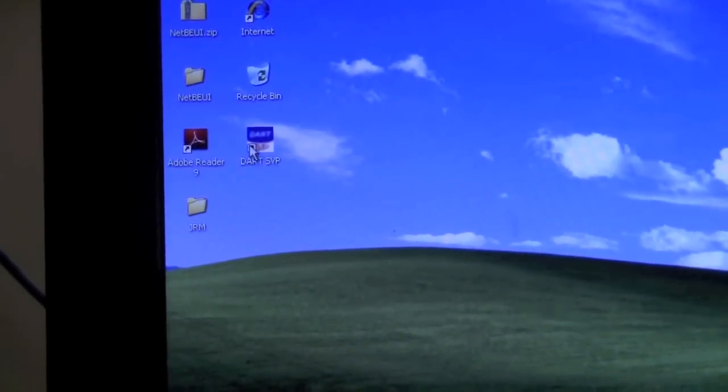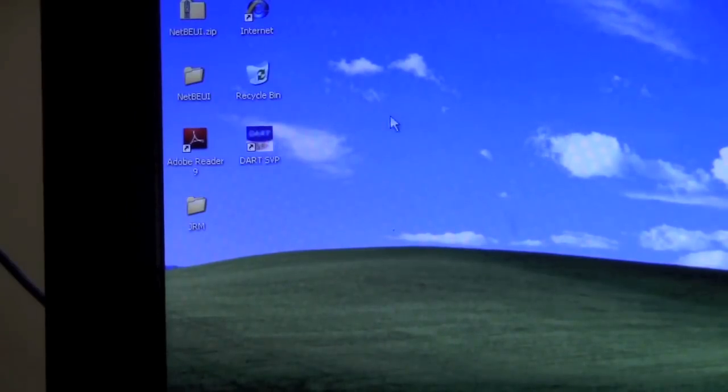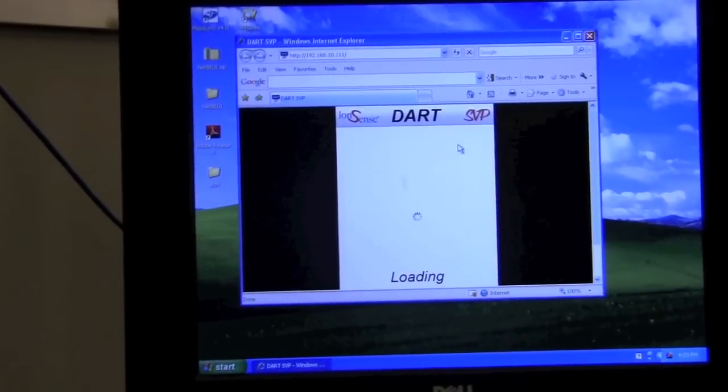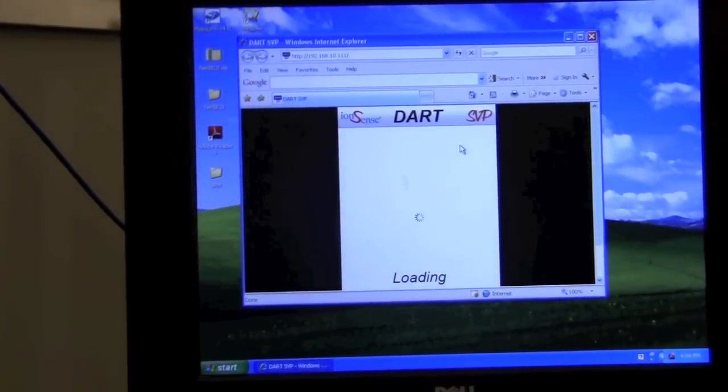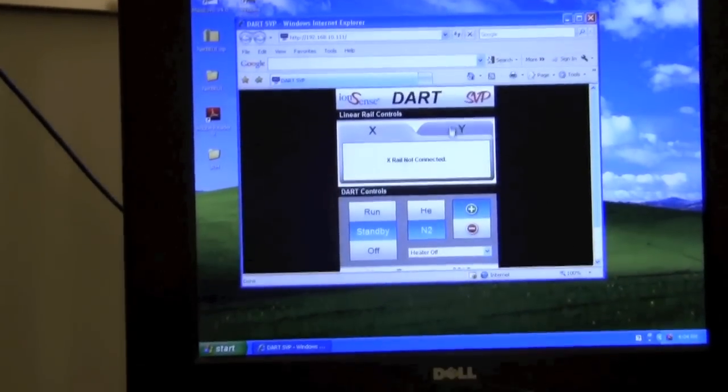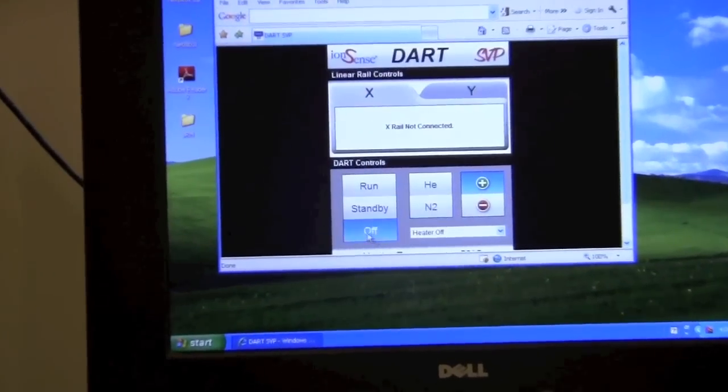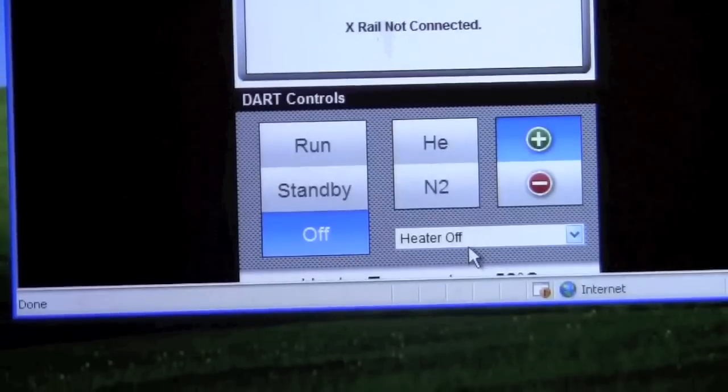Double click on the DART SVP link. This will open up a web page which will show the status of the DART source. When it's not in use it should be off with the heater off.